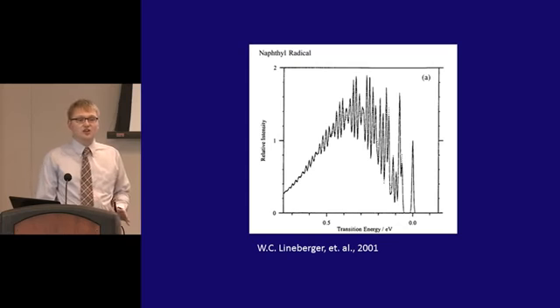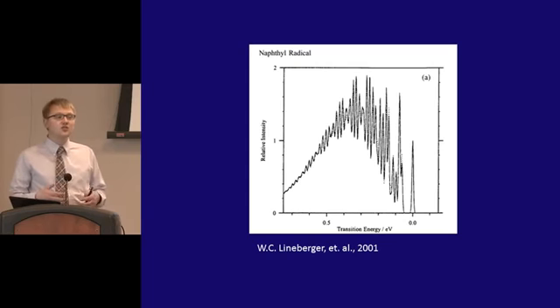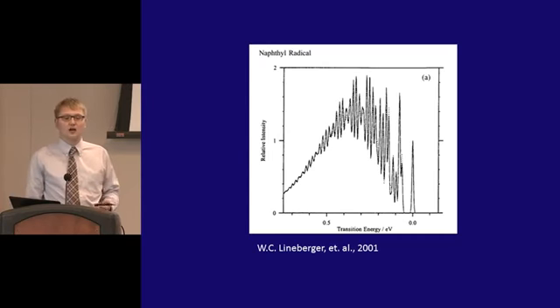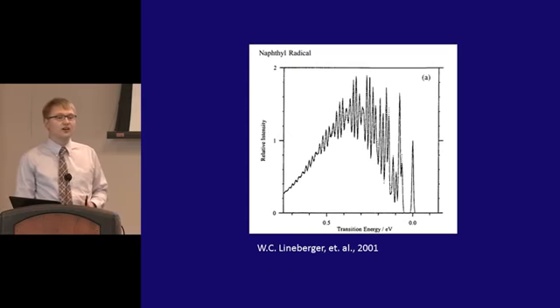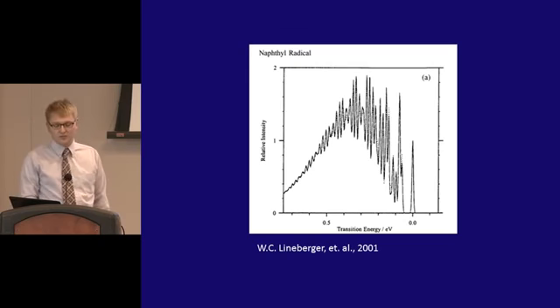The electronic structure governs everything we do. Fundamentally, the way two substances will interact with each other is governed by the electronic structure. The electronic structure will tell us about solvation rules, or whether a substance will make a good battery electrolyte, a good alternative fuel, a good catalyst. And photoelectron spectroscopy provides us with a way to learn about the electronic structure, making it very powerful.